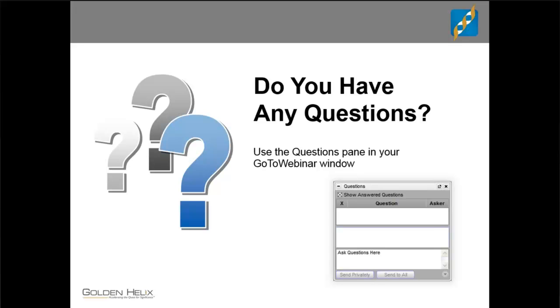There's an interesting one on the algorithms that we're using too. Yes. Can I touch on that? Go ahead. There's one question about do we use ANNOVAR or SnpEff?